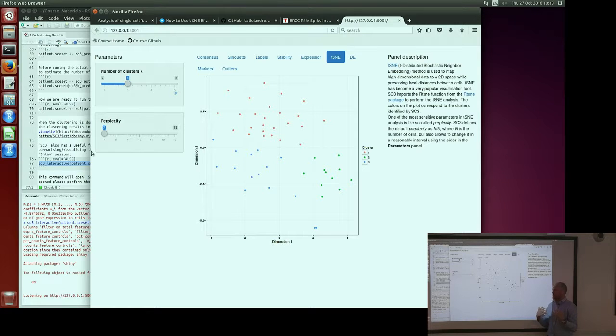If your data is not strong enough, so the signal is not strong, then it might change the structure. But there are also several ways, like in Seurat, you can increase the number of steps, because tSNE, I think, is also iterative, so you can increase the number of steps that you run it for, to wait until it converges to some stable solution. But I had a bad experience with tSNE, so I wouldn't recommend it to anyone. This tab is included because of the popularity of tSNE.